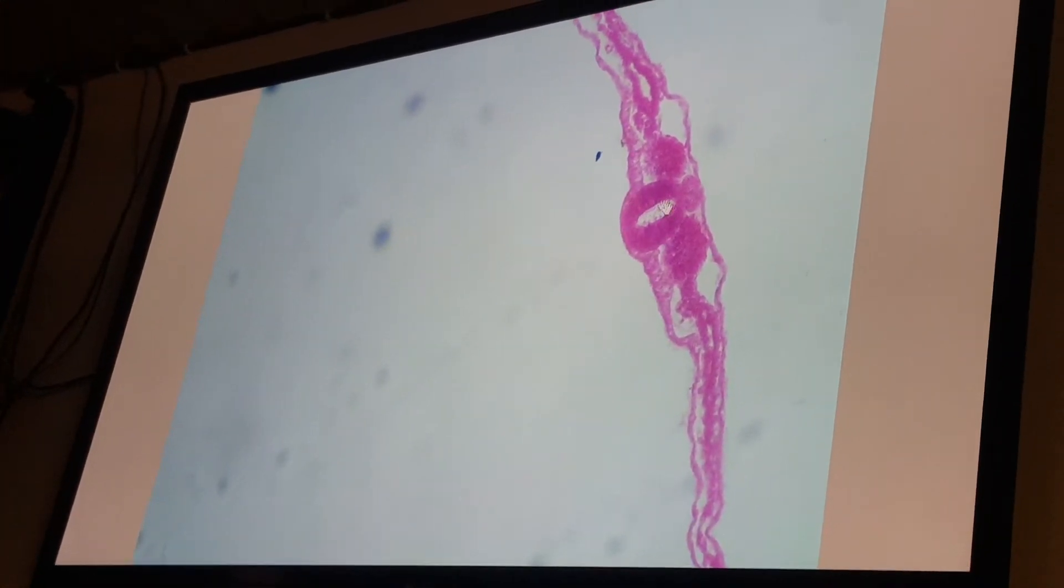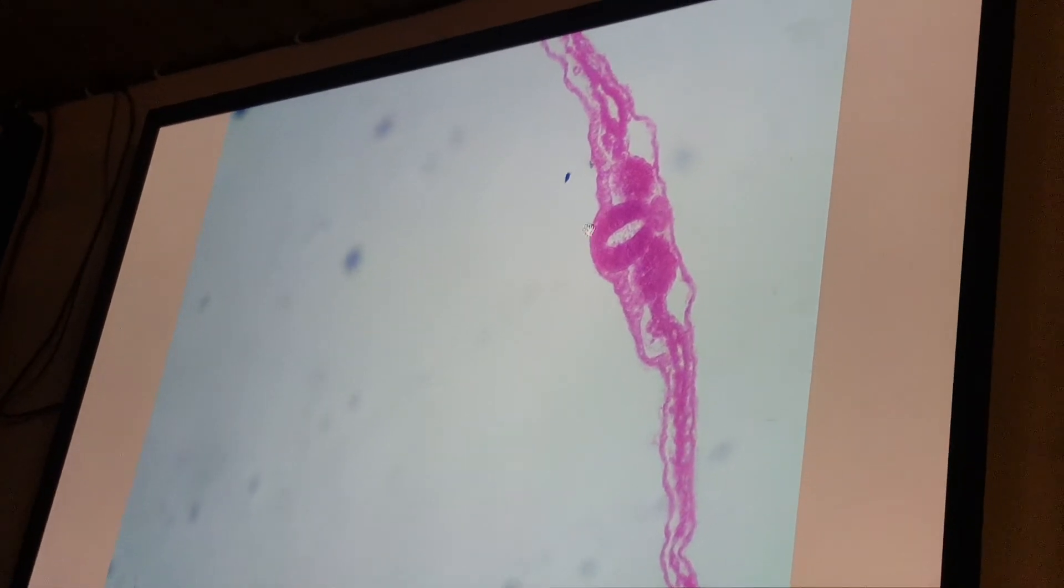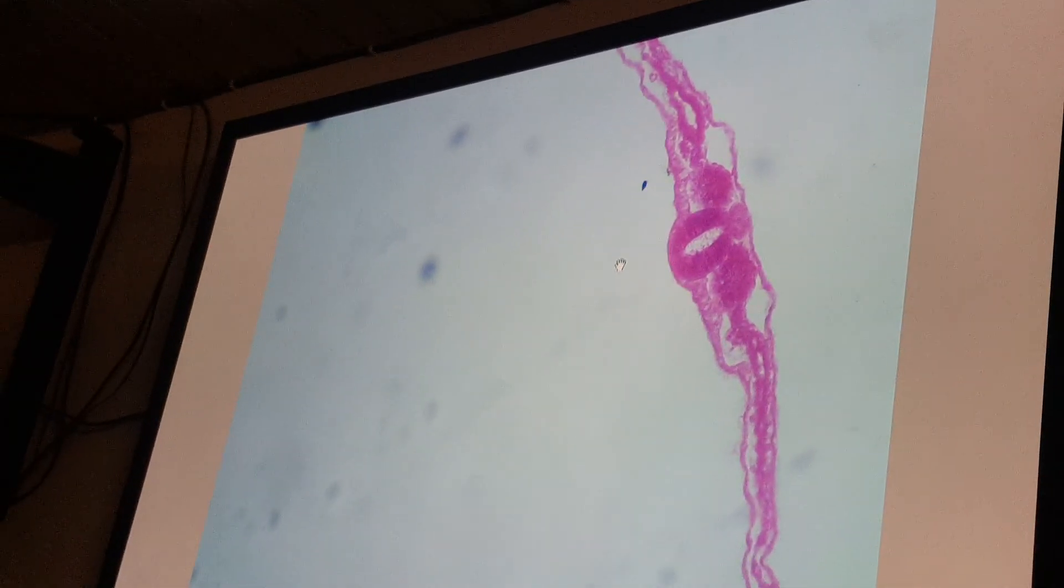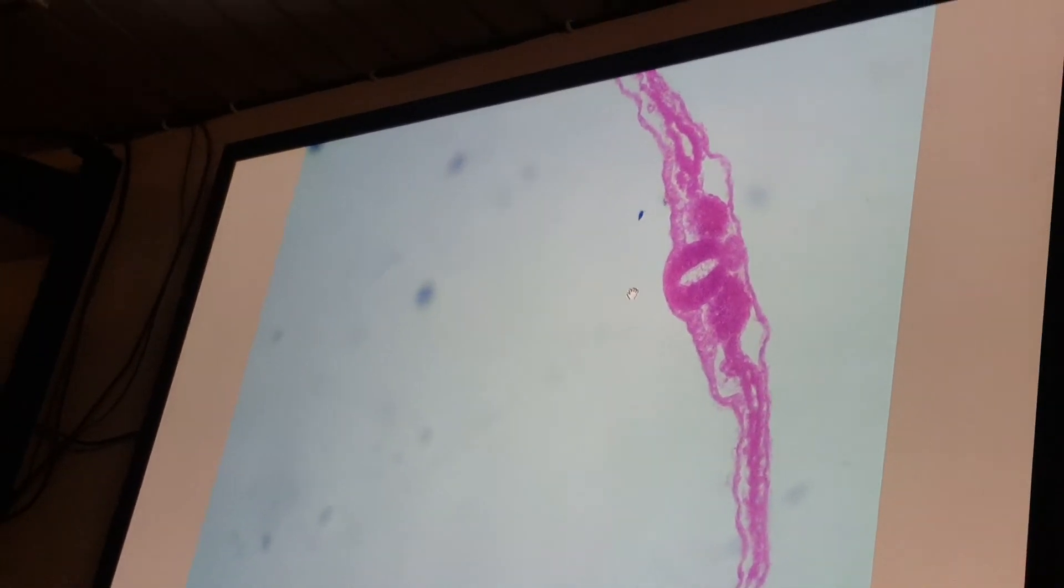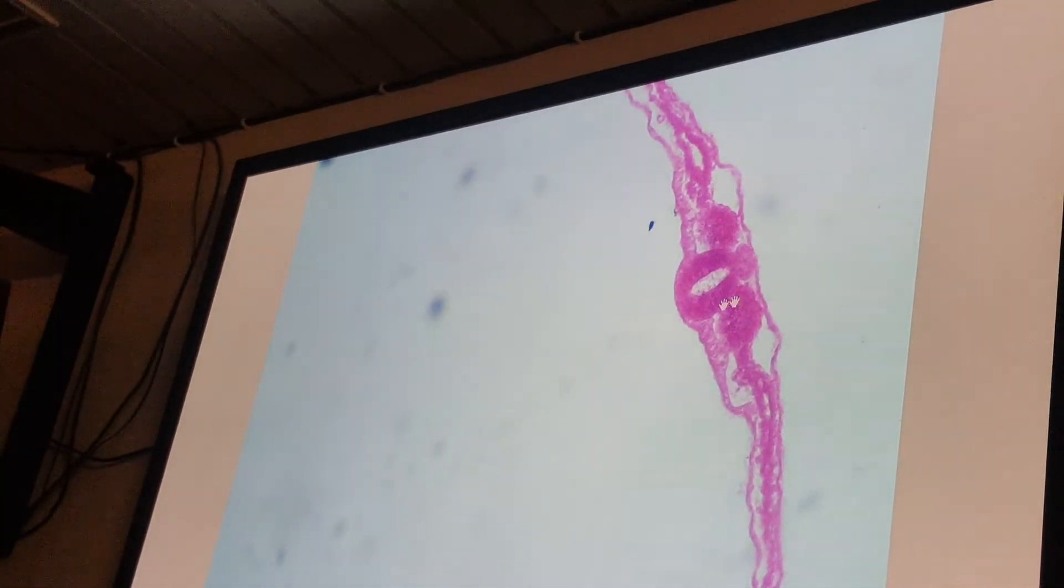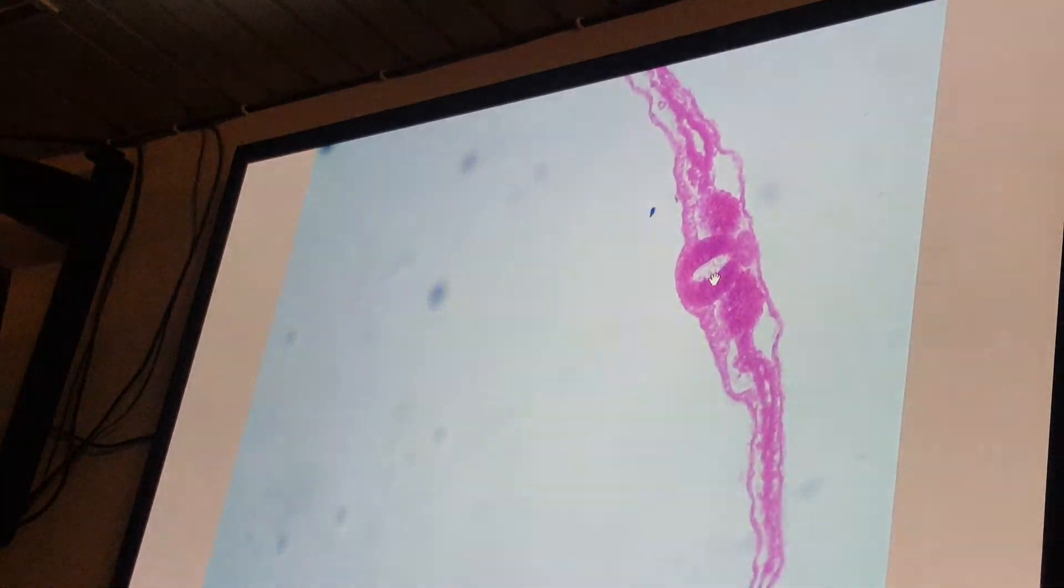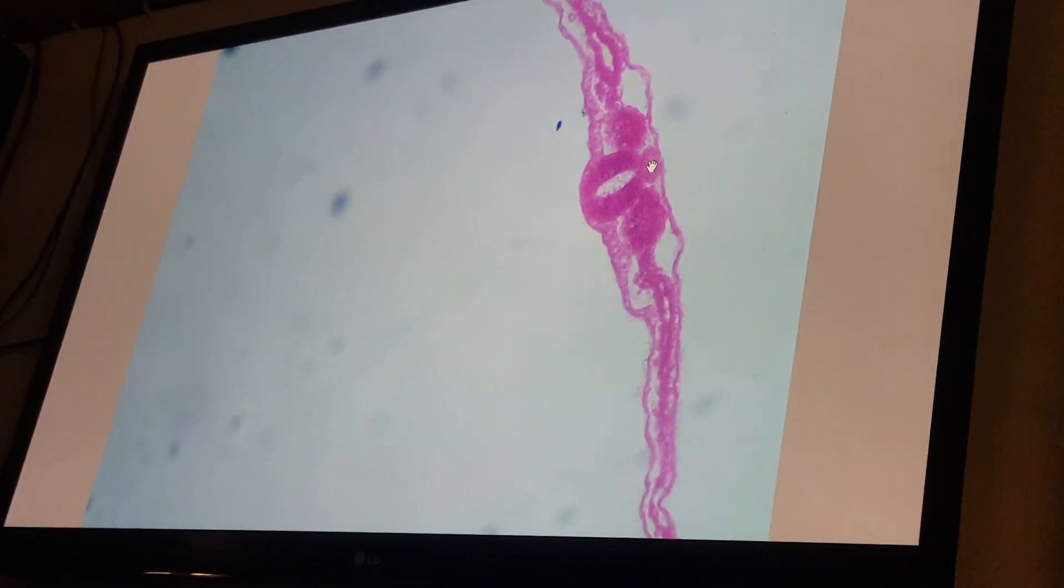Neural fold closes, forming the neural tube. In the beginning, the plate folds, and then the tube. Ventral to the neural tube, notochord.